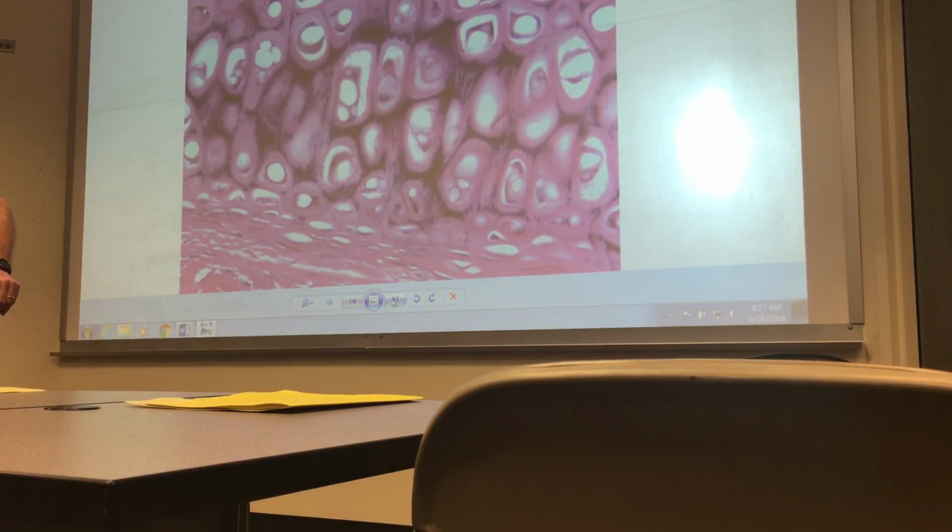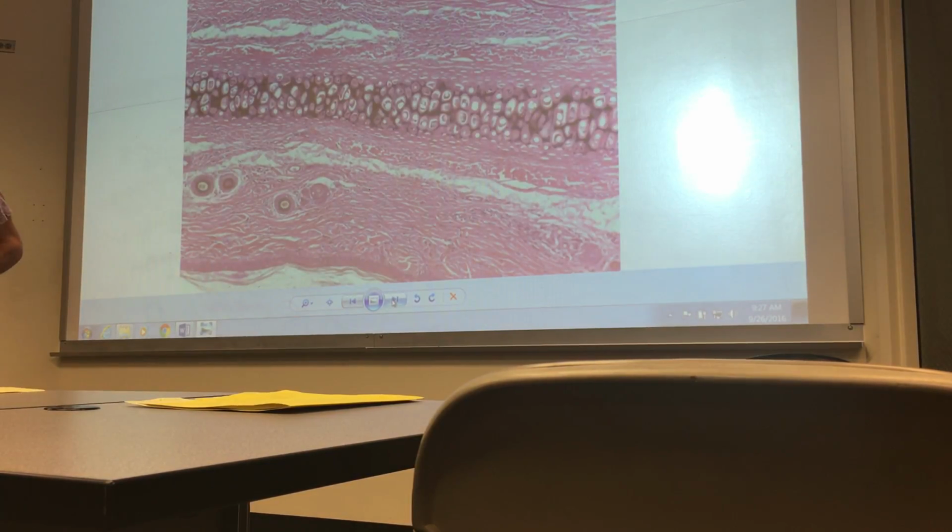There's an interesting story that goes with this slide that has often been the bonus question on the practical. I've already told you this is an ear, and I actually made this particular slide. There's a little mouse that I used to see out in the parking lot, the west parking lot over here. I used to see him all the time, especially in the winter.